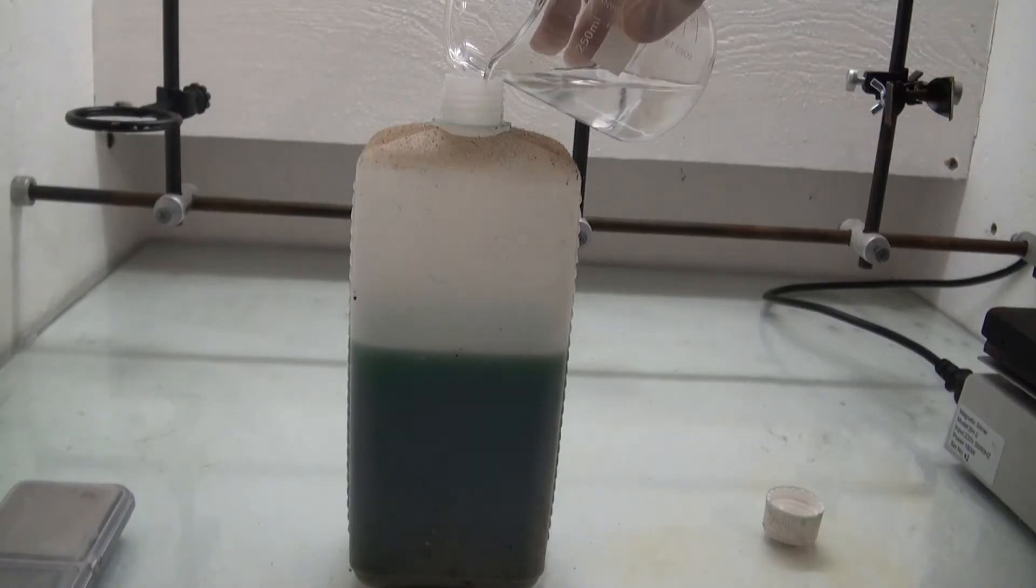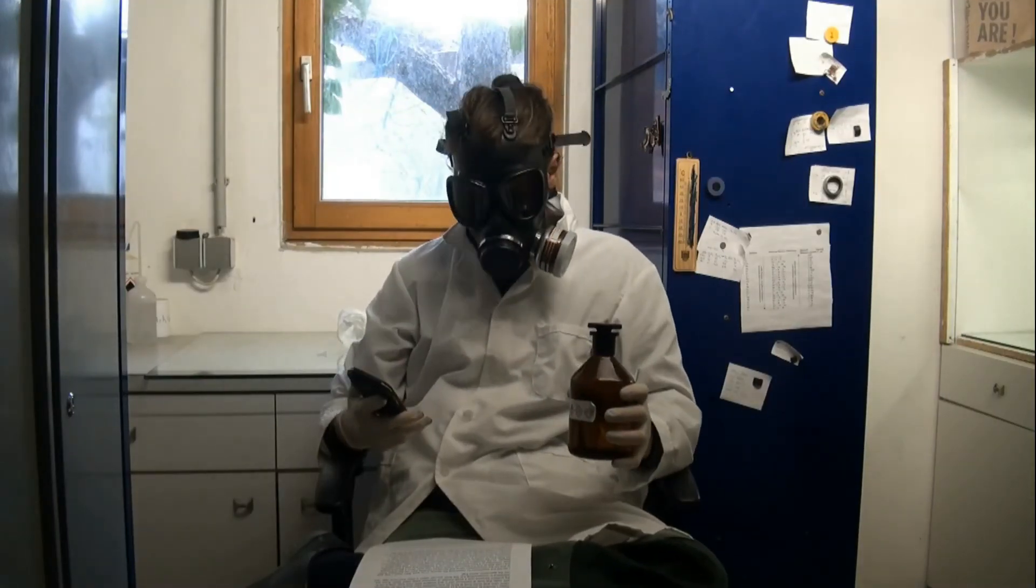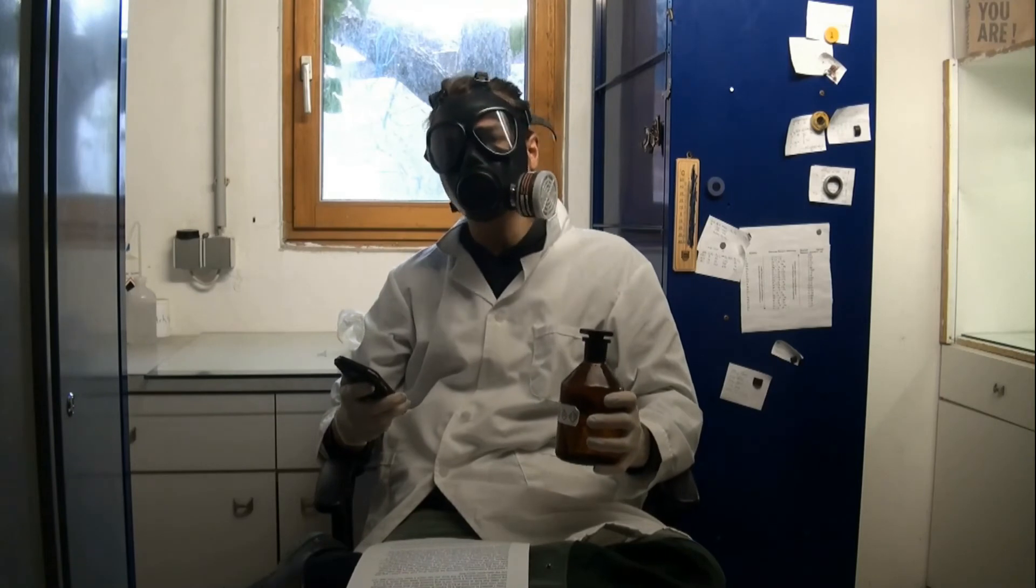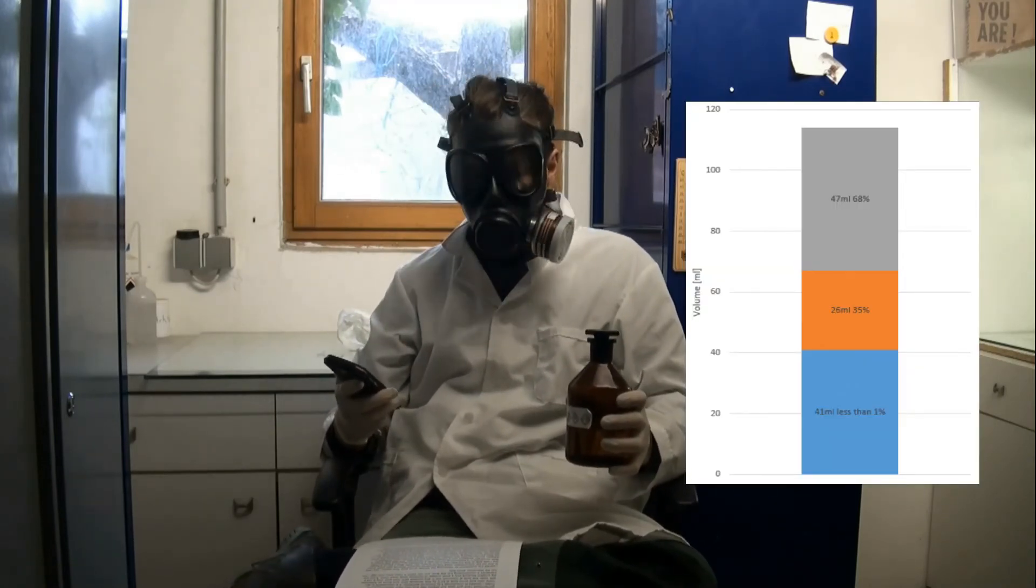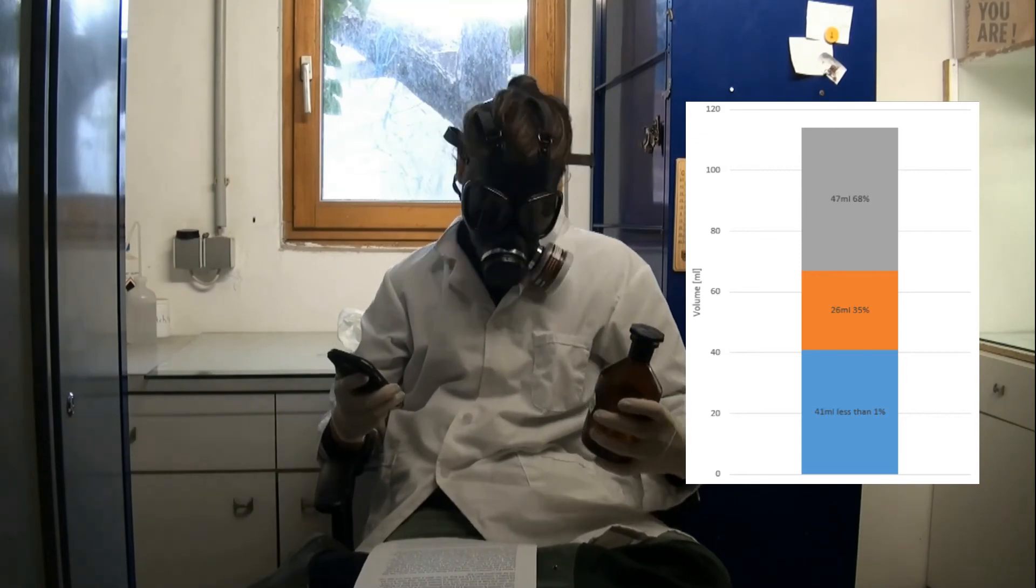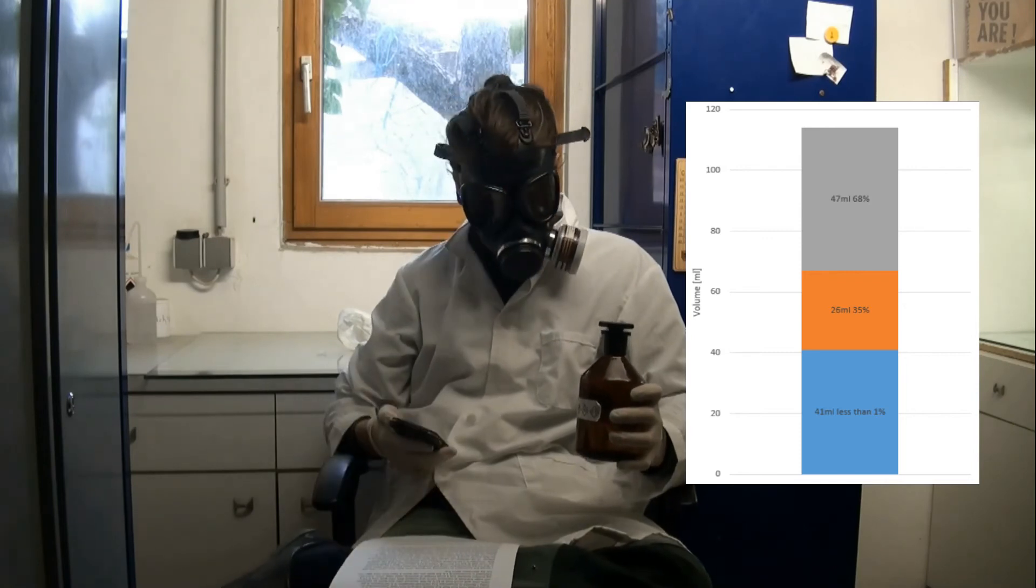This was added into my waste nitric acid container. Now as a summary I was able to turn 150 milliliters of 44% nitric acid into 47 milliliters of 68% nitric acid and 26 milliliters of 35% nitric acid.